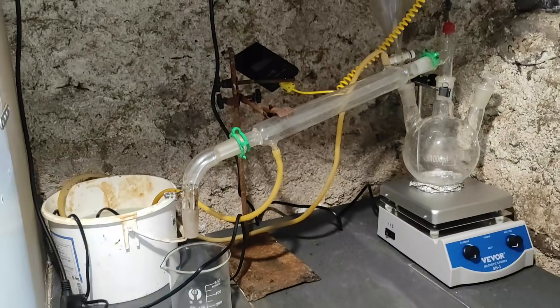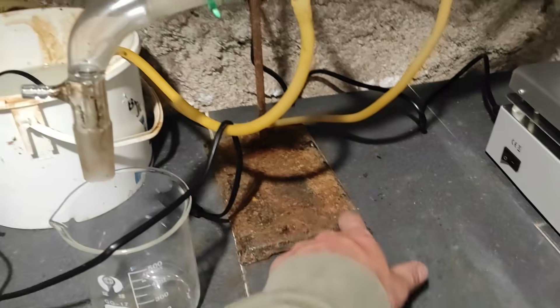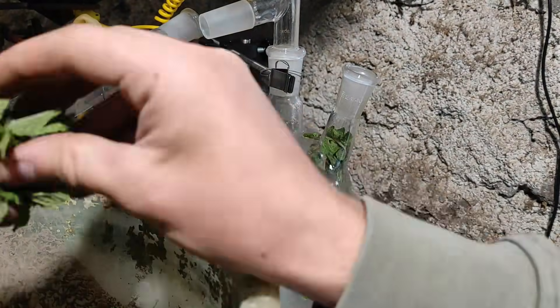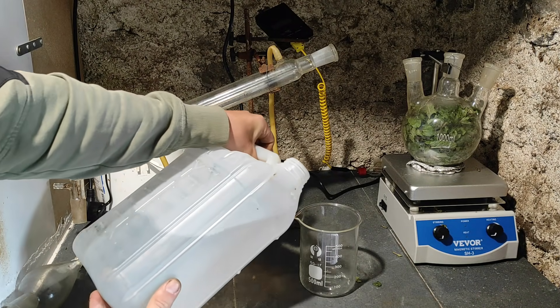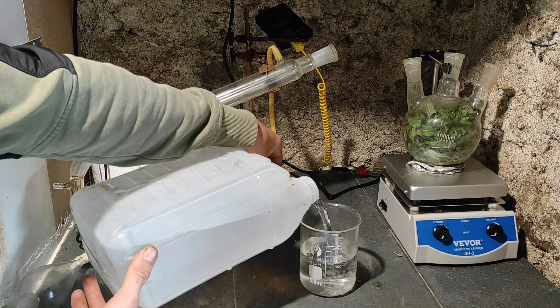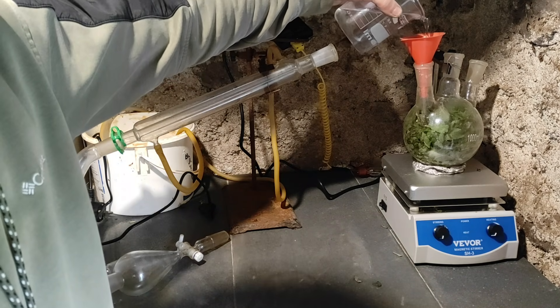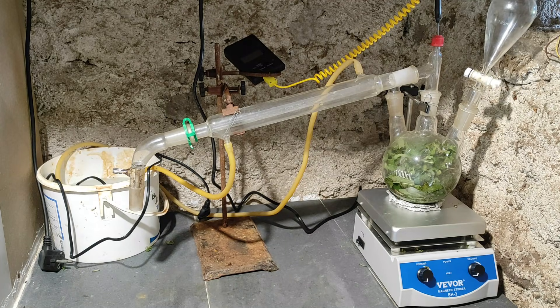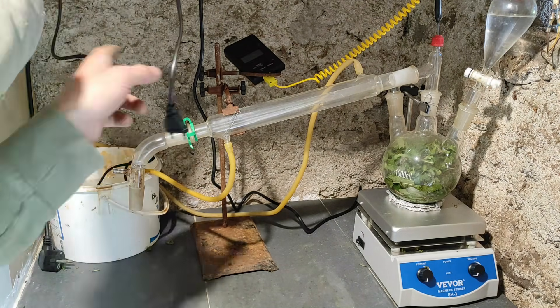Since my three-neck flask is only one liter, I will have to do multiple batches. I packed as much mint as I could into the flask, then measured out approximately 150ml of water in the beaker and poured it all into the flask as well. I've also added an additional funnel with water in case we don't have enough.